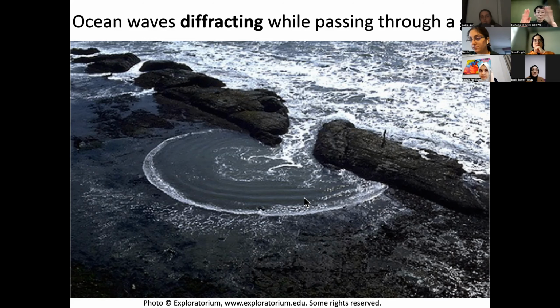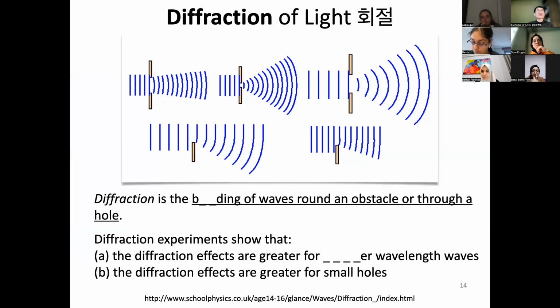But this was broken recently. About 100 nanometers is usually the diffraction limit, but people tried to make a trick to avoid this, to get it down to the 10 nanometer scale. That's why they got the Nobel Prize about 9 years ago. So that's what I will emphasize.